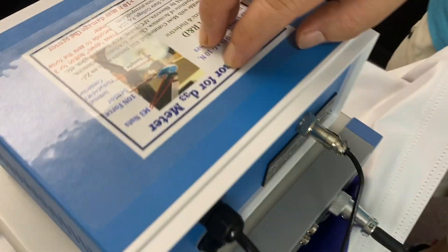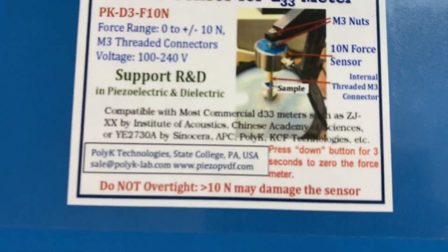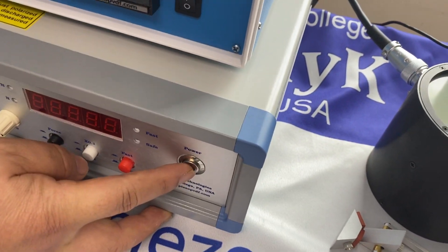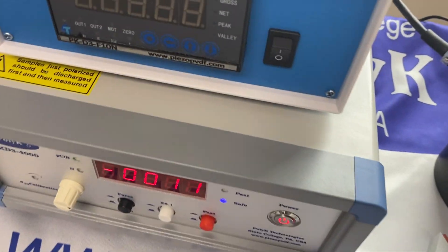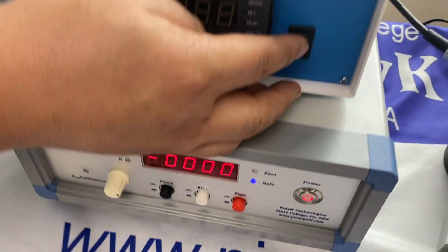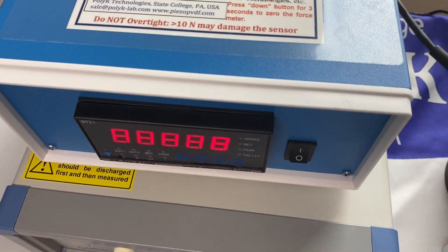This is a static force sensor that can be used at 100 to 240 volts. Now let's turn on the meter — just press that button, you see it starts. And also turn on the static force sensor. The static force sensor measures the force applied to the sample.